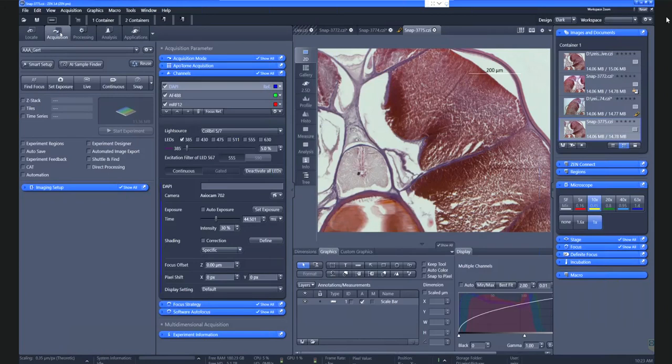Years back, the moment the first digital cameras were available, it was mostly a color camera, and people had to use a color camera for even fluorescent and dim samples. In our days, we are the happy ones. Color cameras are very good at imaging stuff like this, and whenever possible, we should go with a black and white camera if we have to deal with fluorescent samples.